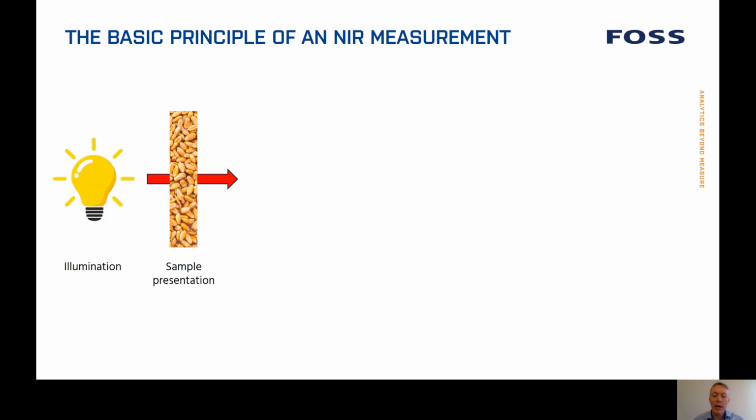Next, the light must interact with the sample. There are a number of different ways of doing this, which I will come into later. But this geometry or sample presentation needs to be matched carefully to the nature of the sample and the parameters that you want to measure.